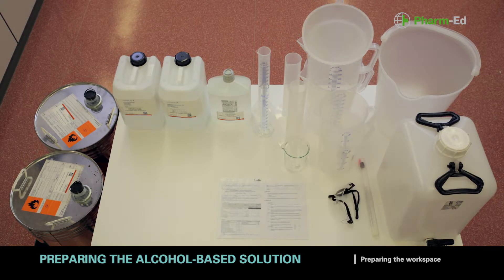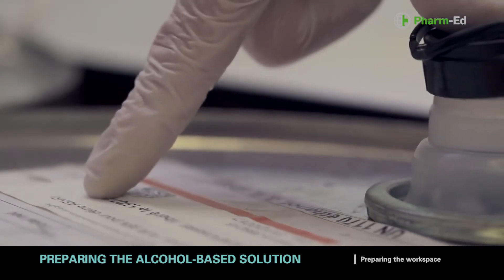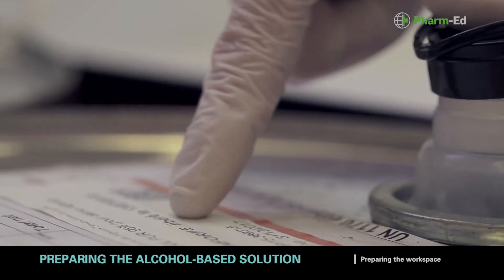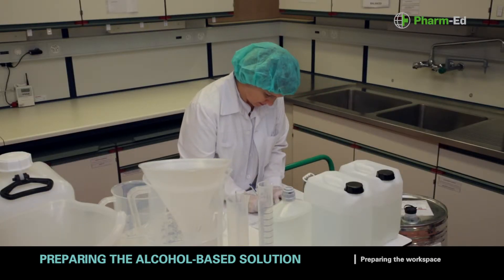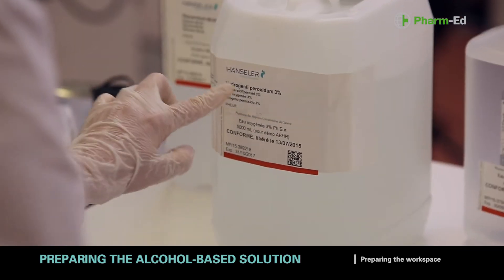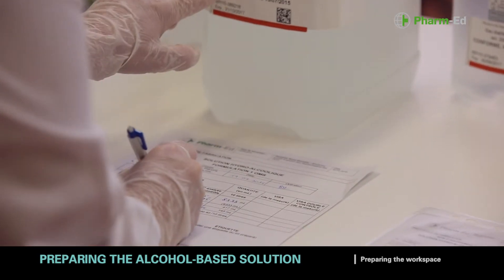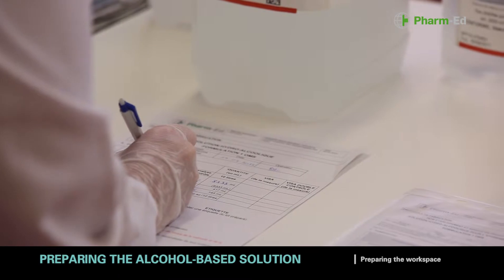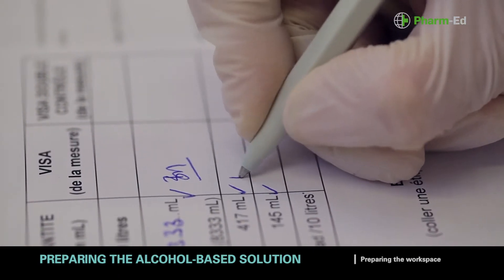If necessary, calibrate the container for the volume of 10 litres and make a mark on it. You should etch the mark onto the container to prevent it from being erased by alcohol or other substances. Check that the identity and quantities of the products are consistent with the production documents and check their expiry dates, also in relation to the period of use of the finished product. Write down the batch number and the compliance analysis number for all raw materials on the production sheet.